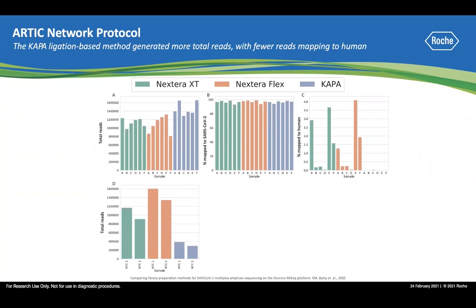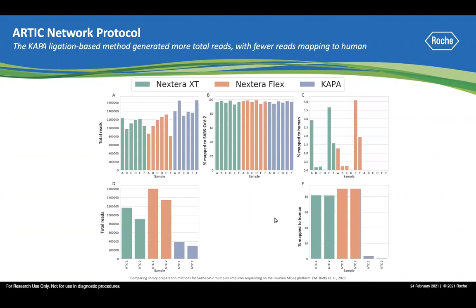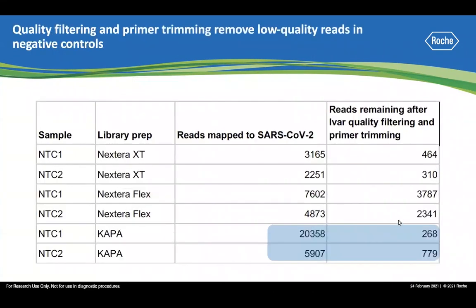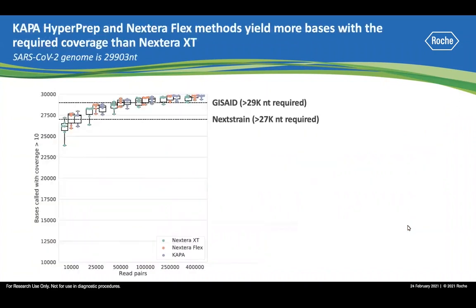Looking at the no-template controls (NTCs), there is a significant number of total reads in libraries prepared from the two tagmentation workflows, with most of those reads mapping to humans. About 1% of reads in the NTCs prepared by KAPA HyperPrep workflow mapped to SARS-CoV-2. However, after removing low-quality reads by quality filtering and primer trimming, the actual number of SARS-CoV-2 reads in NTCs from KAPA HyperPrep workflows is very low and similar to Nextera XT, and significantly lower than Nextera Flex. These SARS-CoV-2 reads in the NTCs are likely the result of index hopping.